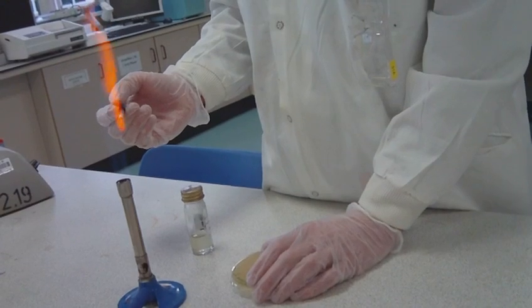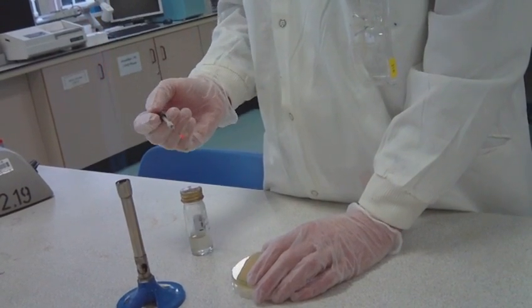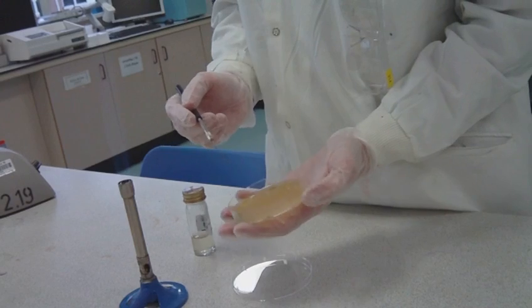Flame the loop again and repeat the process of streaking onto the next quarter of the agar from 3 to 6 o'clock.